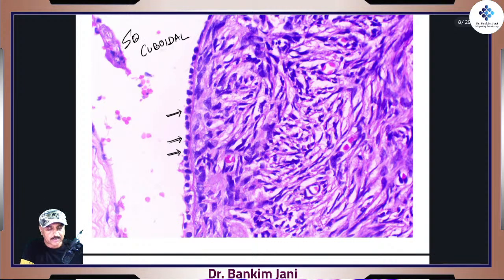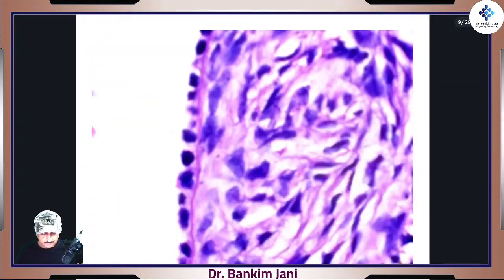So it has to be squamous cuboidal, right? Obviously epithelium. And see, this is 100x, right? Females would appreciate that they look like some special precious stones.